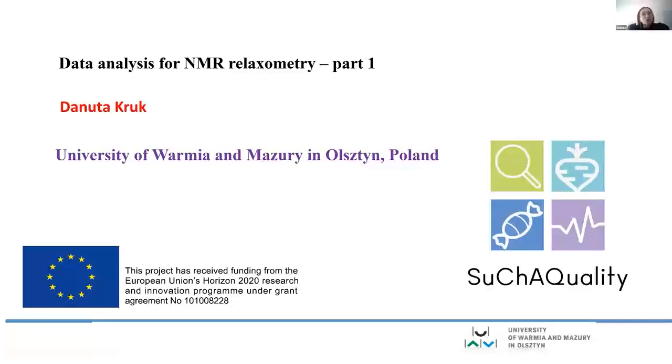So we are supposed to analyze NMR relaxometry data, which we collect as a part of our project. And today I would like to explain to you what the relaxation dispersion data actually mean, what kind of information they include, and how to extract the information, not resorting to very advanced mathematical models. This would be the first goal.